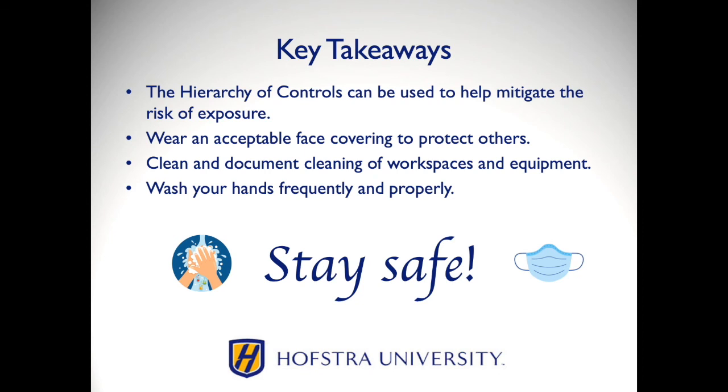Remember that the hierarchy of controls can be used to mitigate the risk of exposure. It is our responsibility to wear a face covering in the form of a cloth mask or a surgical mask to protect others. Clean and document cleaning of workspaces and equipment. Wash your hands frequently and properly. And remember to stay safe.